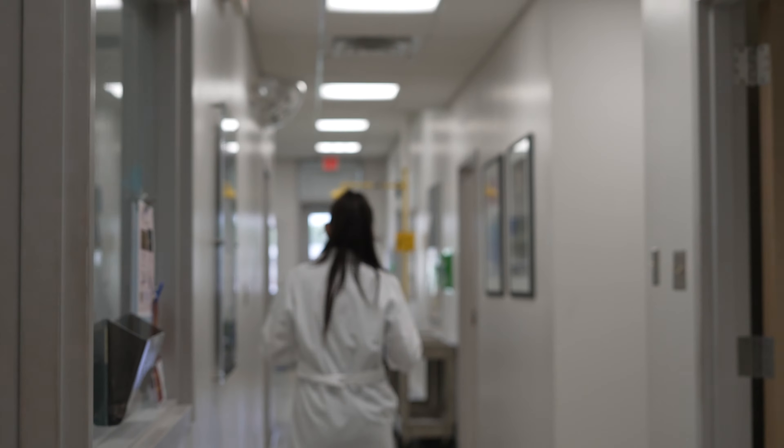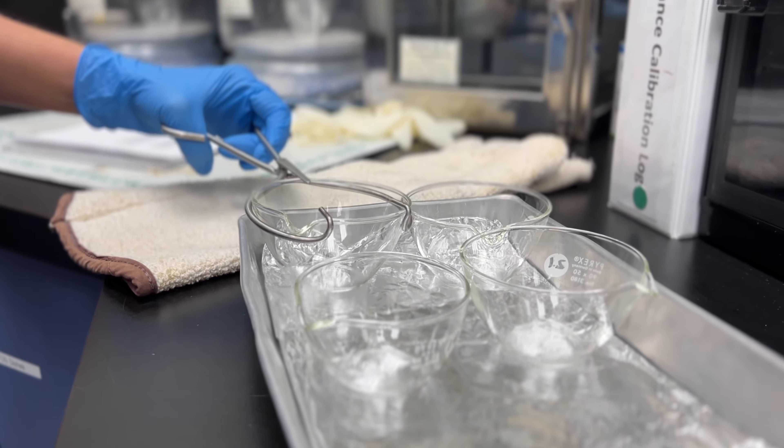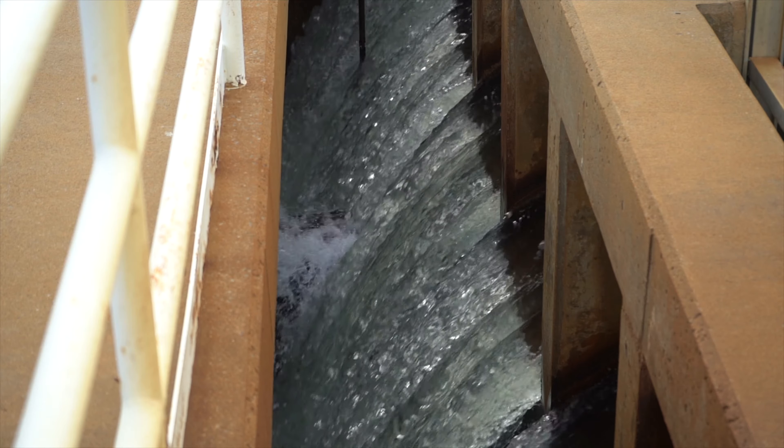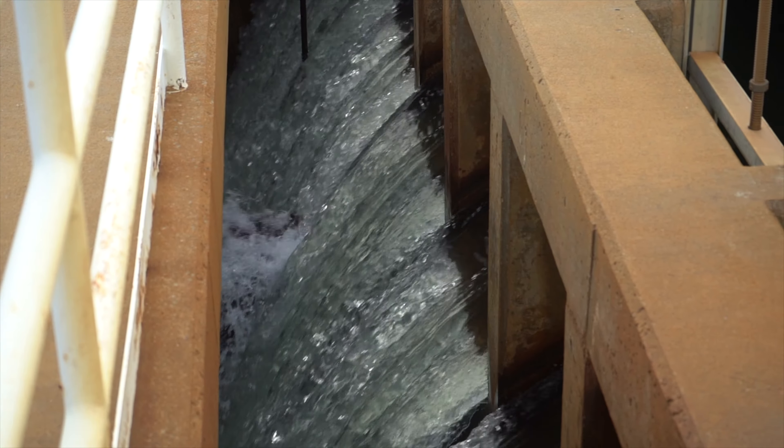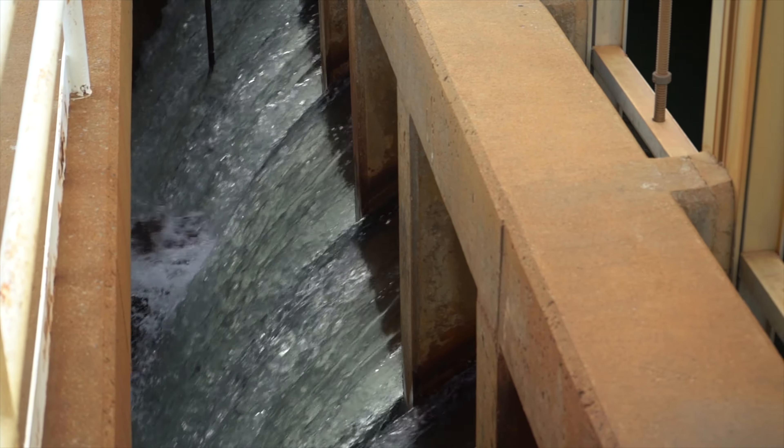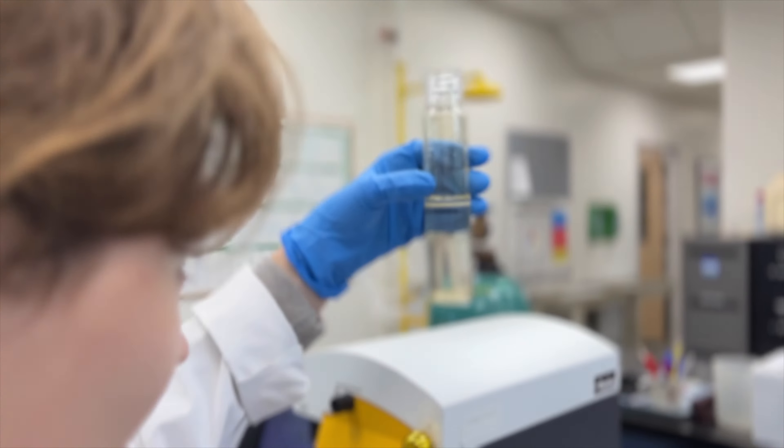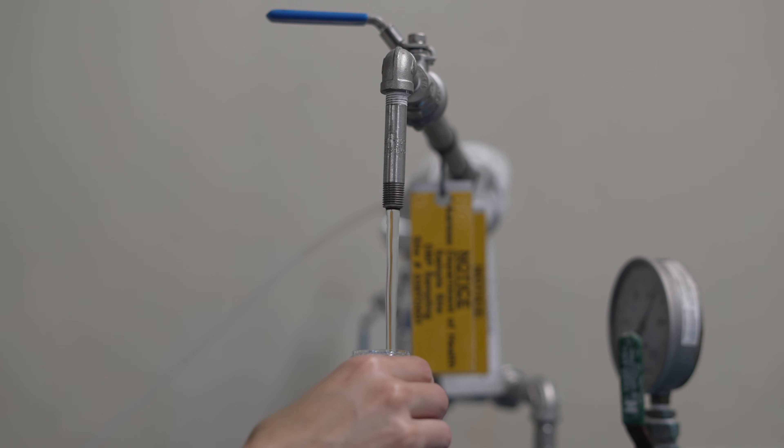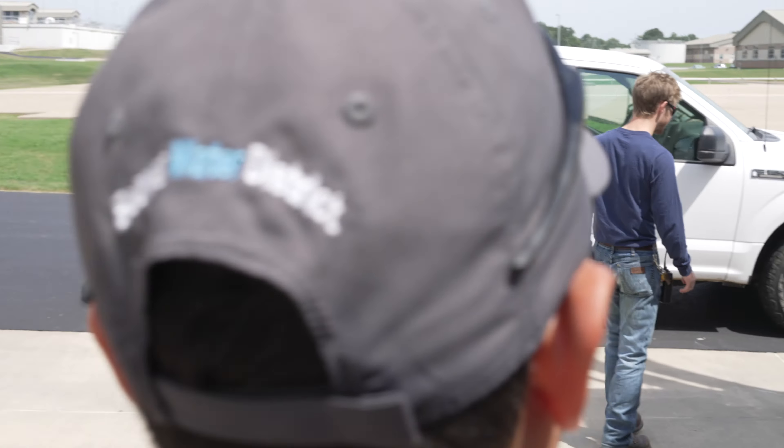You're working with your hands, you're doing analysis, you're doing paperwork, and just being able to see the difference between that raw water coming into the plant—it's getting cleaner and cleaner as it's going through the plant and then finally the drinking water at the end. It's just a very fulfilling job.